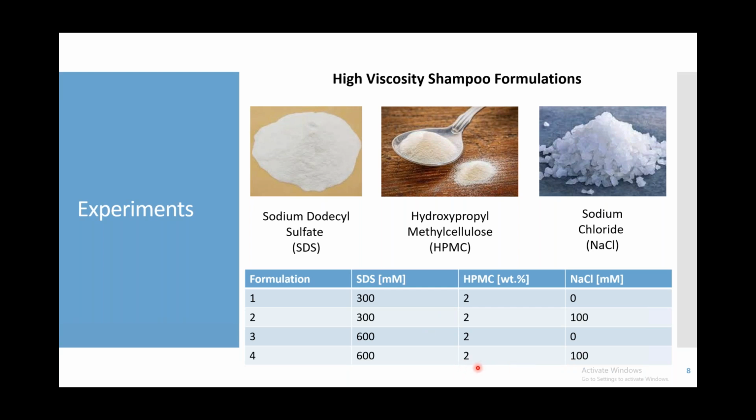And we mixed the solutions at room temperature for at least a couple of days until the polymer was dissolved properly. And between all the measurements, we cleaned the chip flow channels with an aqueous solution, which is compatible with these formulations.